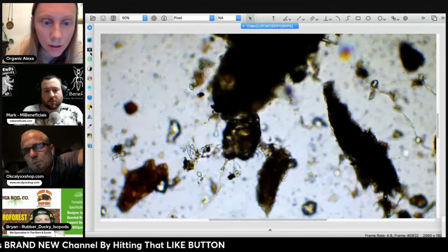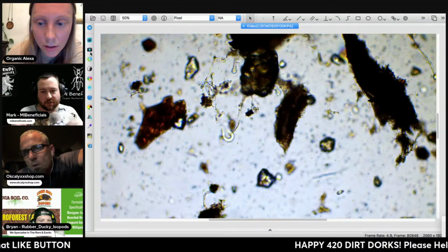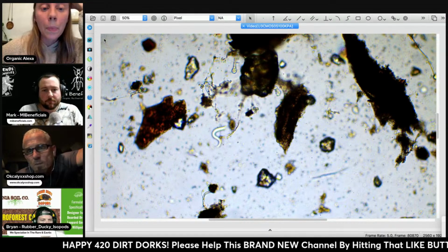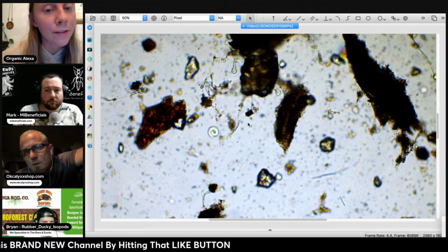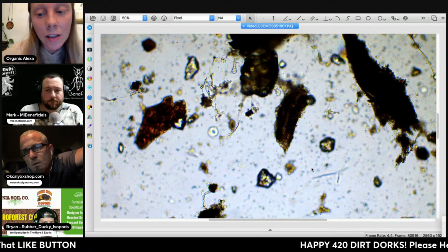What are those micro movers actually doing? Are they eating and breaking down? Yeah. So protozoa are primarily eating bacteria, but really whatever fits into their mouth. They can eat organic matter, they can eat other protozoa.